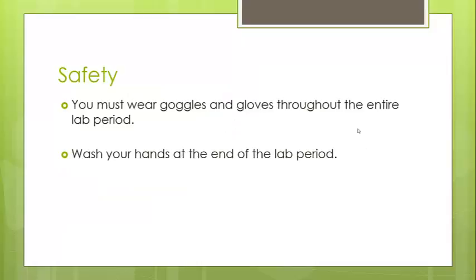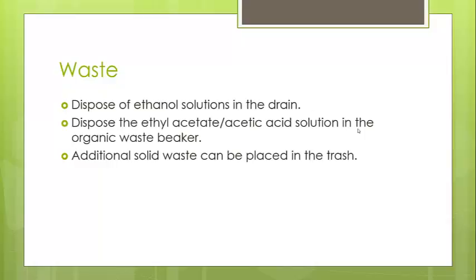In terms of safety, as always, you want to make sure that you are wearing gloves and goggles throughout the entire lab period, and ensure that you wash your hands before you leave. Any of your ethanol solutions can go in the drain. The ethyl acetate acetic acid solution will need to go into the organic waste beaker, and any additional solid waste that you have from the tablets can be placed in the trash.